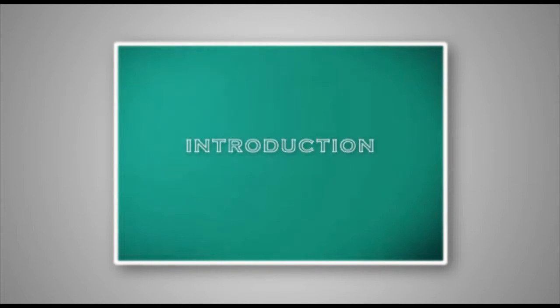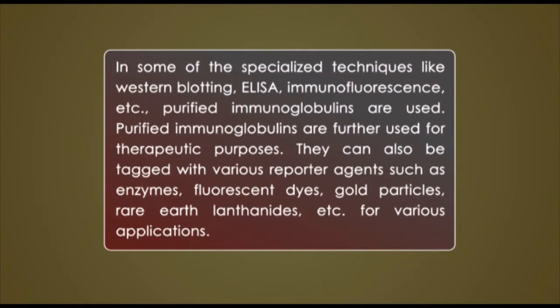Introduction. Immunoglobulins are very versatile molecules. They have been used in various immunotechniques like immunodiffusion, immunoelectrophoresis, ELISA, agglutination assays, etc. Some of these techniques use immunoglobulins without purification, like serum. In some of the specialized techniques like Western blotting, ELISA, immunofluorescence, etc., purified immunoglobulins are used.